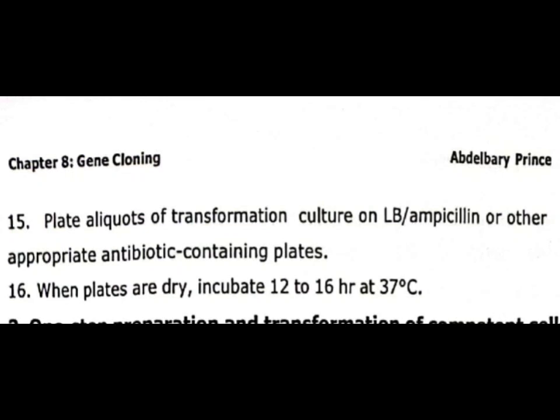Step number 15. Plate aliquots of transformation culture on LB ampicillin, or other appropriate antibiotic-containing plates. Step number 16. When plates are dry, incubate 12 to 16 hours at 37 degrees Celsius.